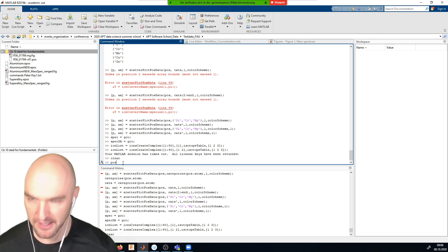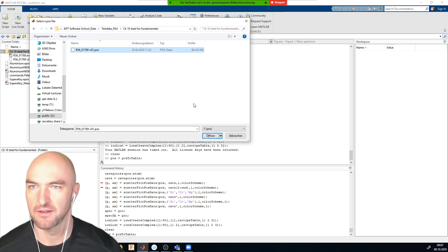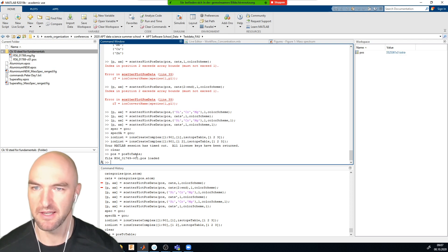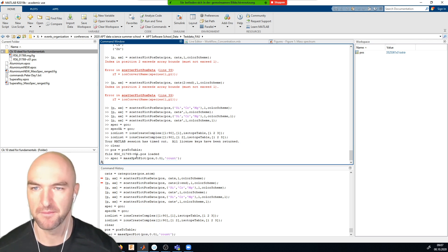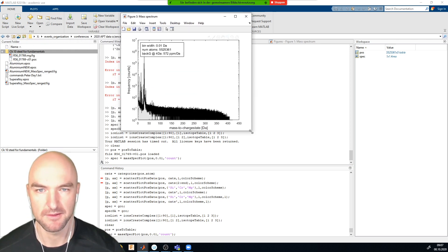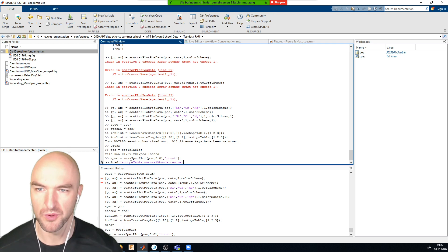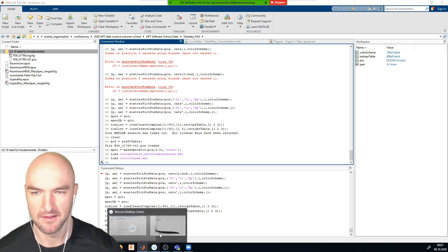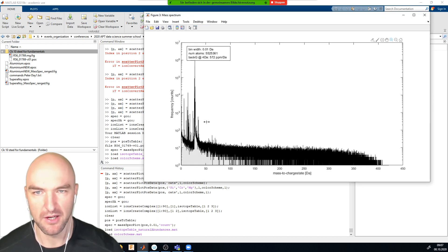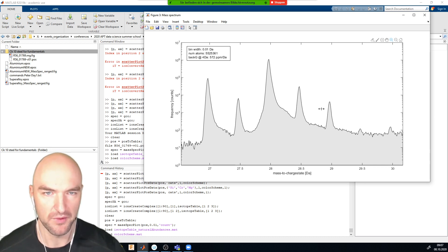I'll load in the steel dataset and create a mass spectrum for it, then load the isotope table and color scheme. Now we can look at the various iron isotopes. I'm going to define the iron isotope range not by the most abundant one but by one of the minor peaks.